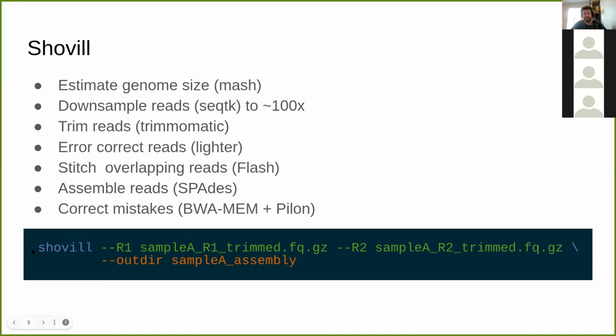So Shovill, you just run the command line. Again, very simple. You feed in your trimmed reads or your raw reads and provide an output directory. That's all you need to do.